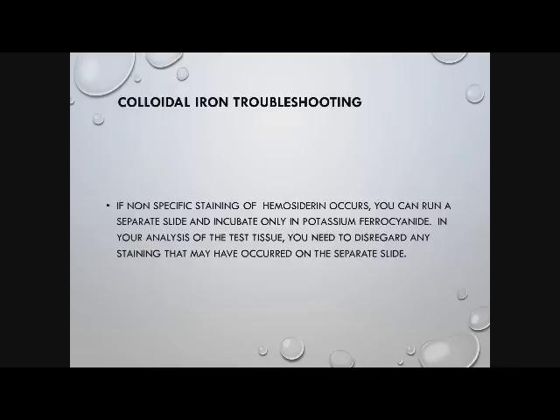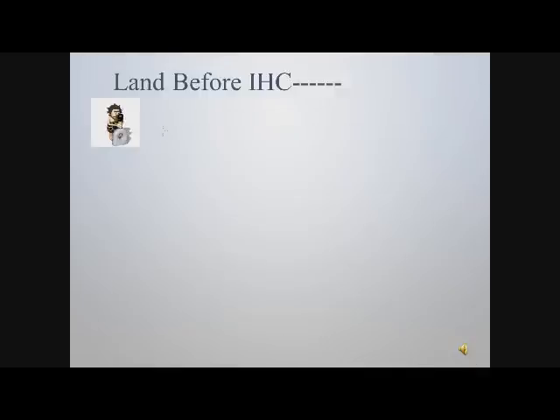So colloidal iron troubleshooting. Well, I could have added one other thing here if we were back in the day that I came from, because we used to have to make our colloidal iron. Anybody out there who still makes colloidal iron, raise your hand. I won't see it, but if you do, I feel so bad for you, because that's the hard part of the colloidal iron procedure. Now that you can buy it pre-made and tested, it makes life so much easier, but you still might run into an issue.